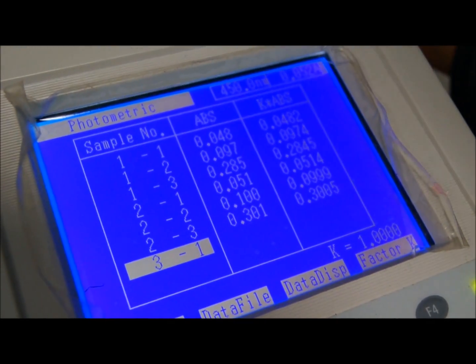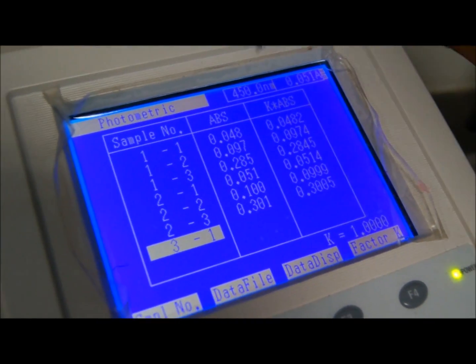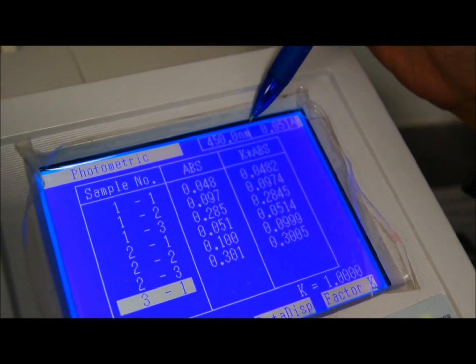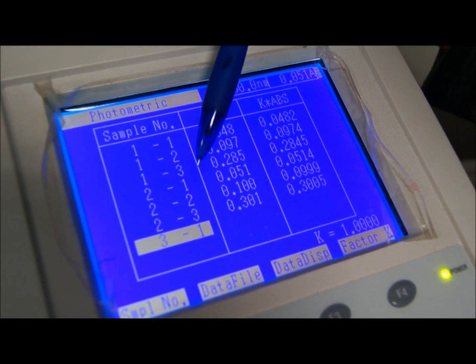Once you have done that, the spectrophotometer will measure for you the absorbance at that particular wavelength. You can see the wavelength up here, and these are the results. Actually just now we only put 3 cells, 3 cuvettes in.